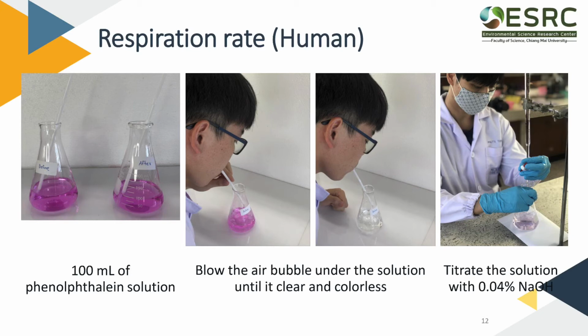Repeat the experiment again after you exercise for 5 minutes. Use new phenolphthalein solution and compare the amounts of carbon dioxide that you produce before and after exercise.